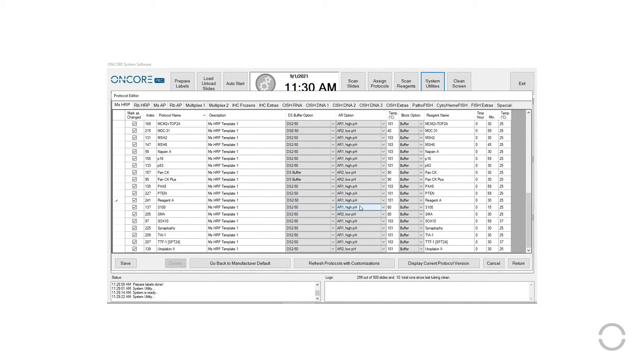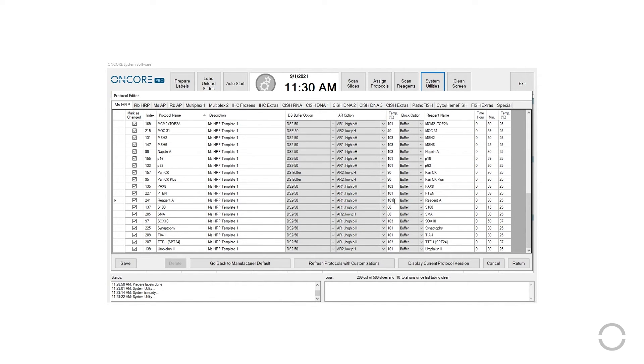The AR option and AR temperature, the block option, primary incubation time, and the incubation temperature can all be customized.